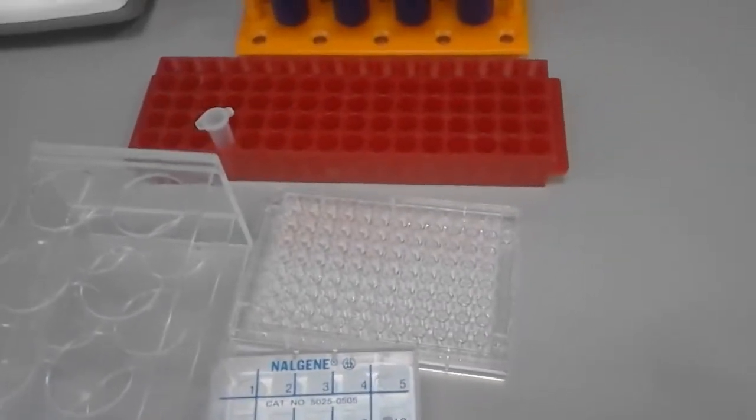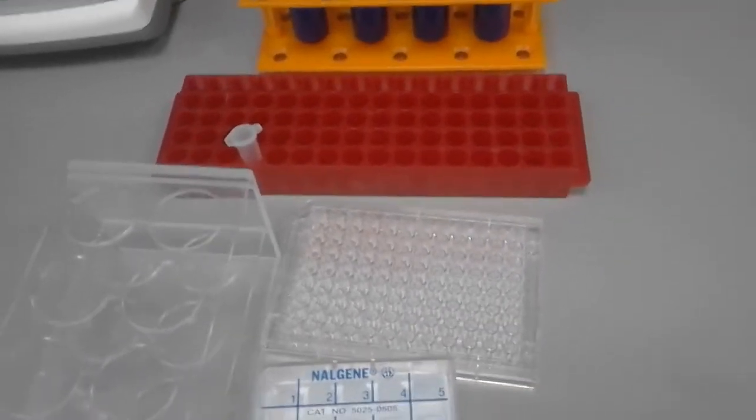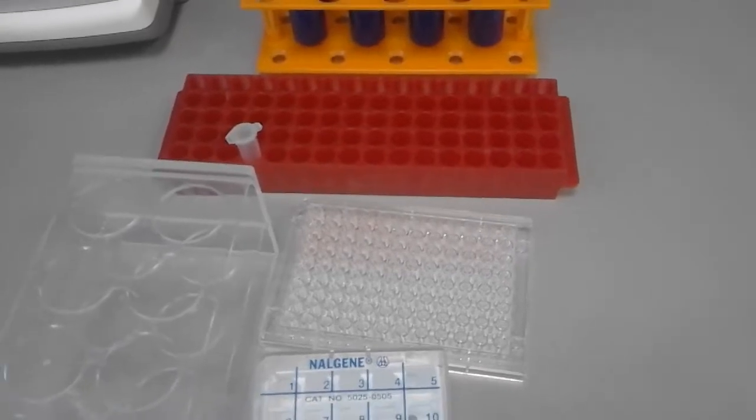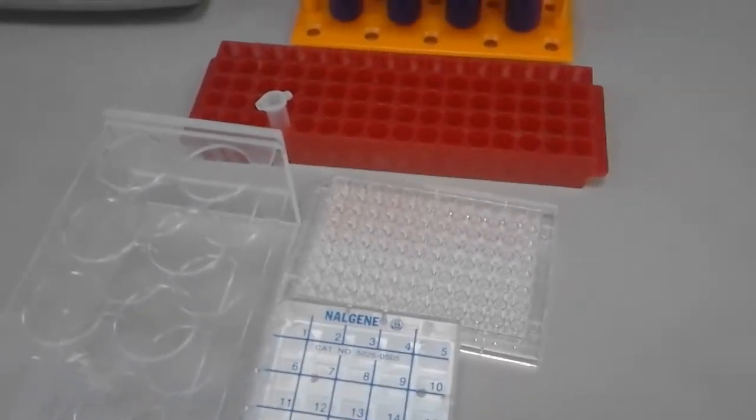because without one, you would use one hand for holding one eppendorf, and that would take time and space, and it would be inconvenient to complete any task you need to do.